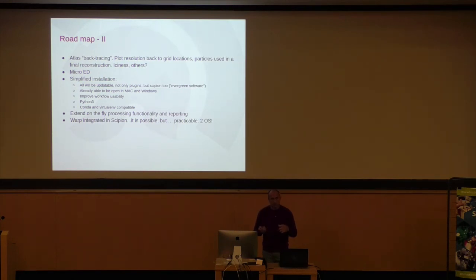So this mapping back of information to the Atlas is already happening. MicroED, I don't know if you do MicroED or plan to, but there are people in Sweden already working on this. They're already building a plugin. So it's starting, and soon you will probably see some MicroED stuff within Scipion.